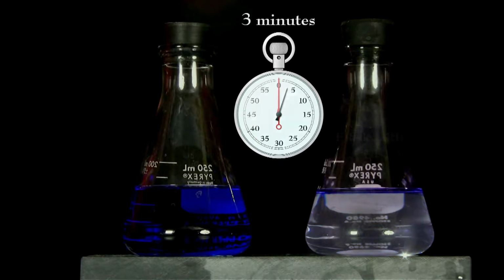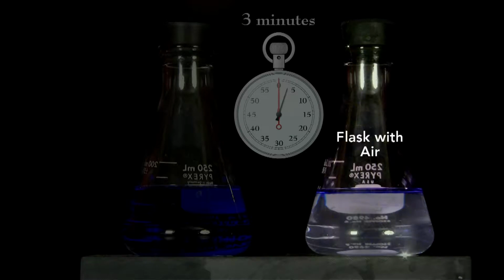Notice how the blue color of the solution fades in this flask, the flask with air. Why is that? Because there is in air, besides oxygen, something else present. The solution left something untouched. There is in fact a gas in air which the solution cannot touch, and this gas is not oxygen and yet is part of the atmosphere. So that is one way of opening out air into the two things of which it's composed: oxygen, which burns our candles or anything else, and this other substance, nitrogen, which will not burn them.